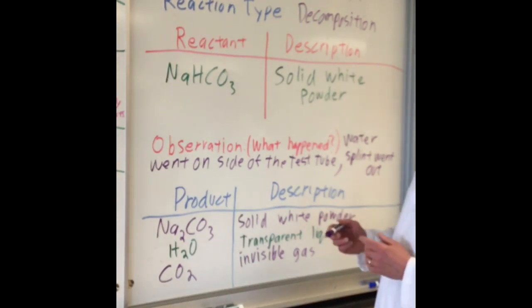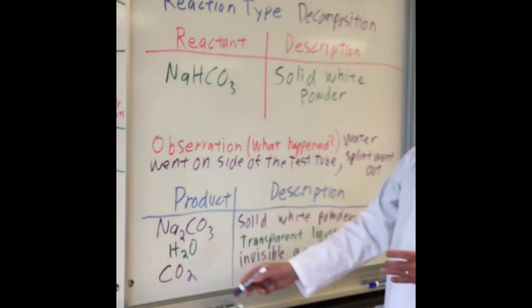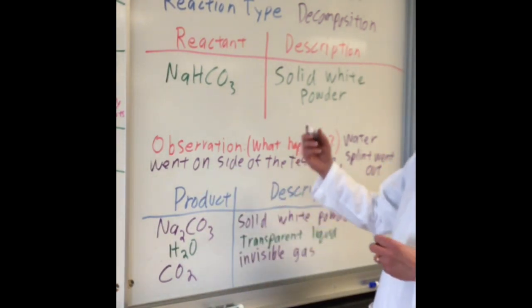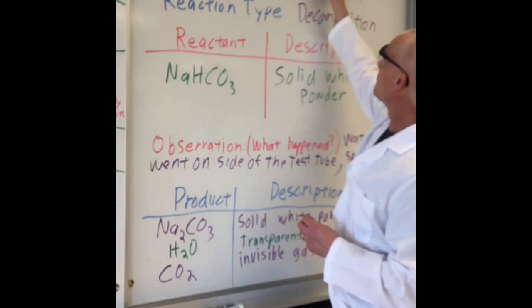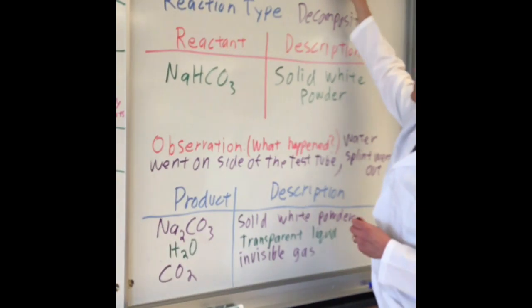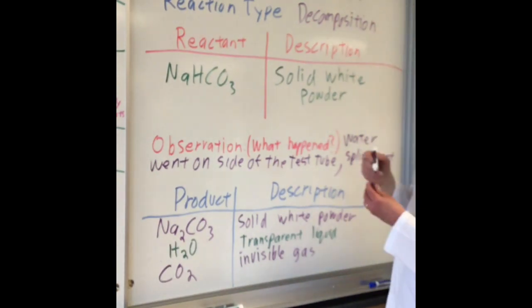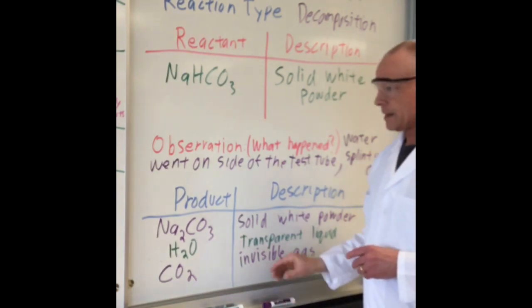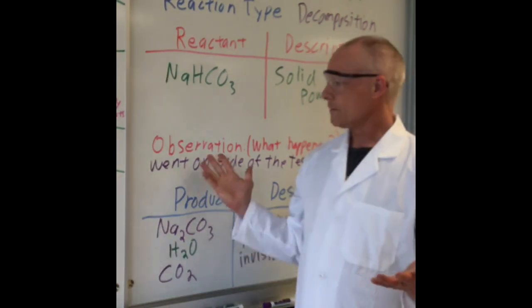And now we can complete our reaction on top, since we have all of our products listed here. Na2CO3 plus H2O plus CO2. And now we have our data table all filled out.